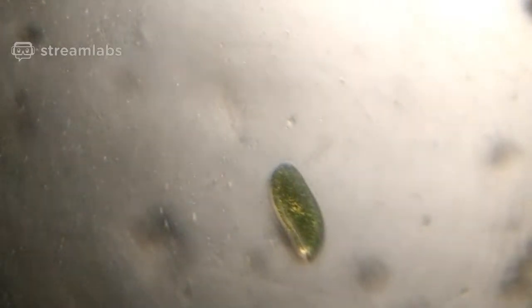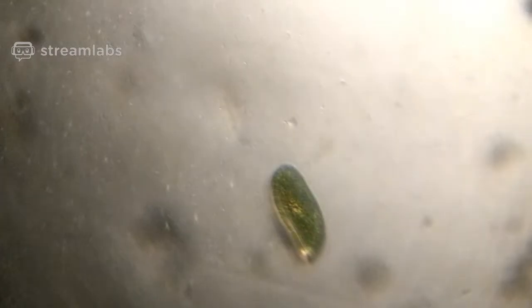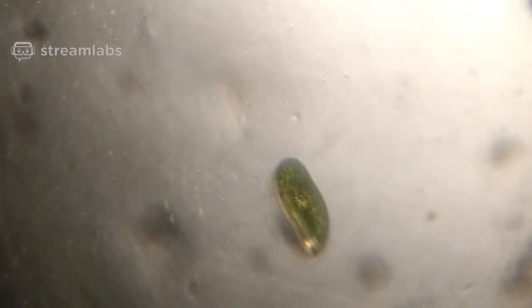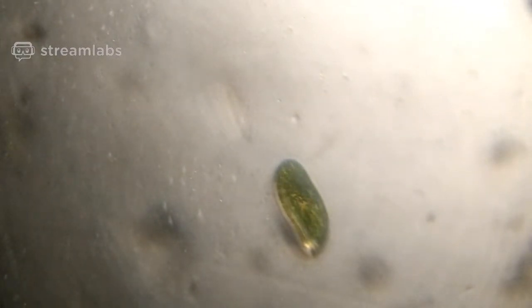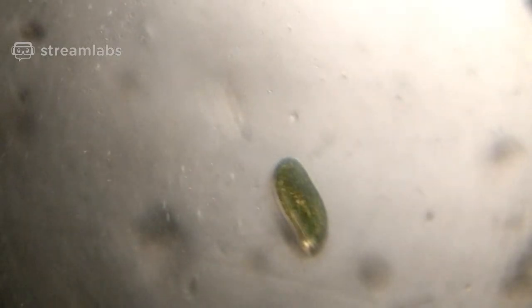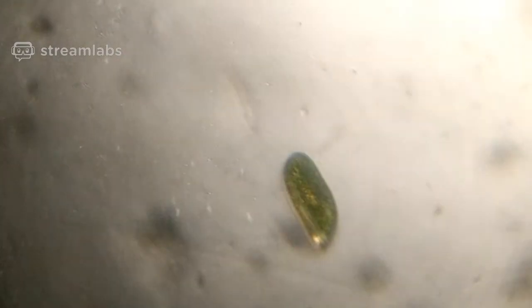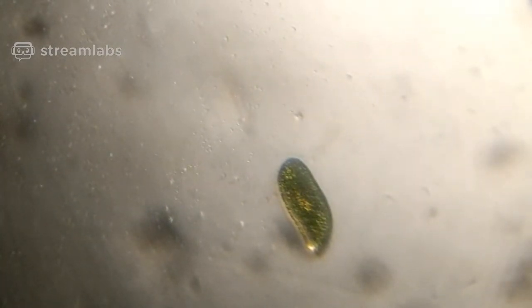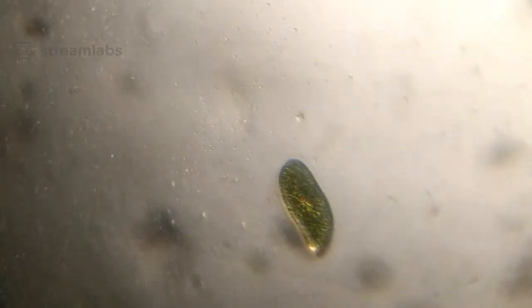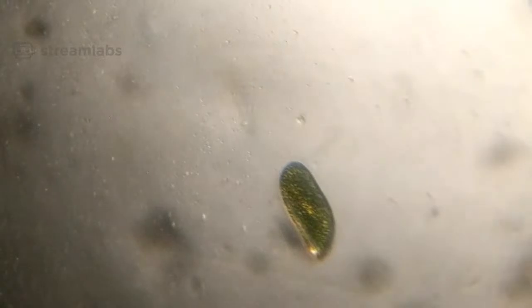One Paramecium multinucleatum and the other Paramecium bursaria. Paramecium bursaria love light. They're extremely easy to grow. Go to any pond and just let it be for a few days. Make sure you have a good light source and you're likely to get them. Wow, how cool is this? Amazing. Can we try to zoom this in a bit?